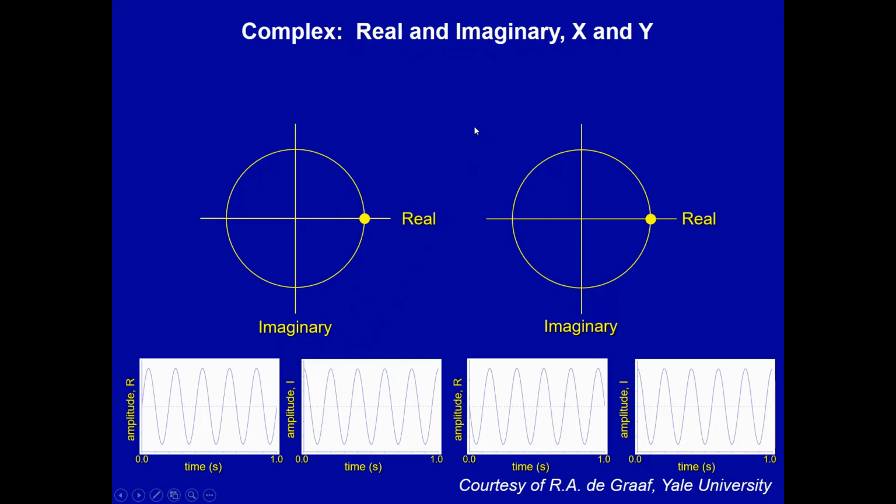Which is arbitrary. But the point is that we have to be able to keep track of where the magnetization is in this real imaginary plane, this XY plane, to know if the frequencies we want to see are a little bit higher than our Larmor frequency or a little bit lower than our Larmor frequency, our rotating frame.